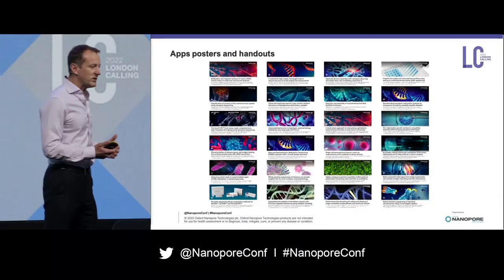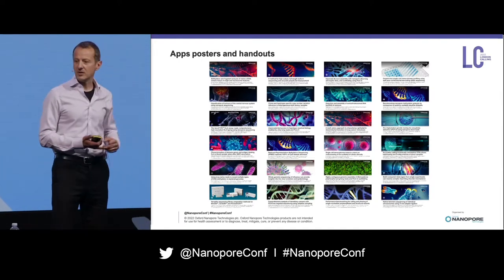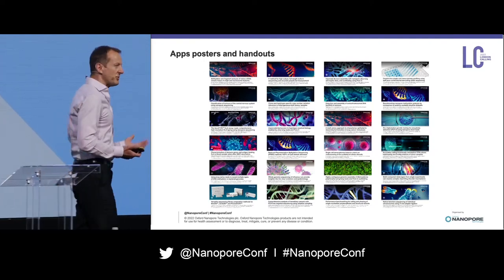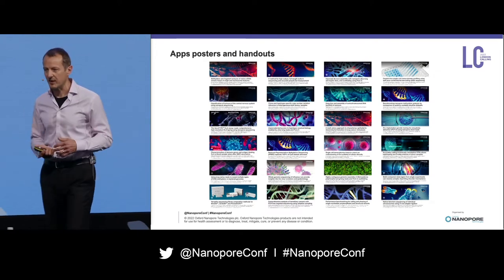genomic application showcasing team and on our benchmarking teams. The showcasing team, they're here to illustrate and to really stretch the capabilities of nanopore sequencing. And the benchmarking team is here to measure how well the platform performs on a range of very standard analyses, such as SNP calling, SV calling, methylation, and so on. And they also report on best practice as well, so that if you want to do a particular analysis, the benchmarking team will tell you what the best combination of library prep and analysis tools is for that particular job.